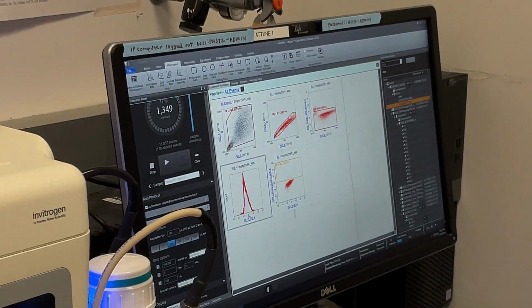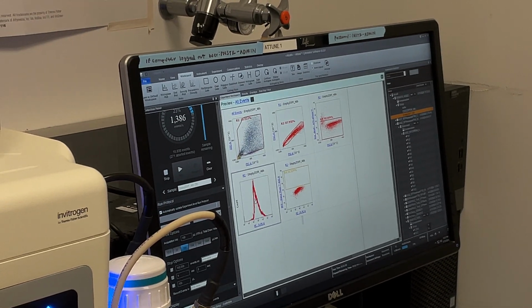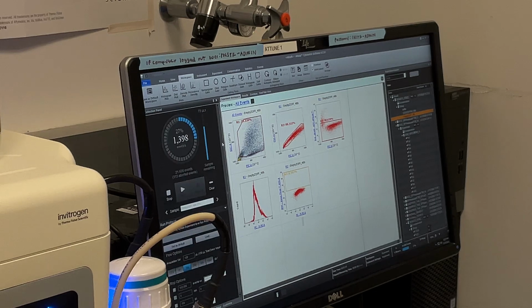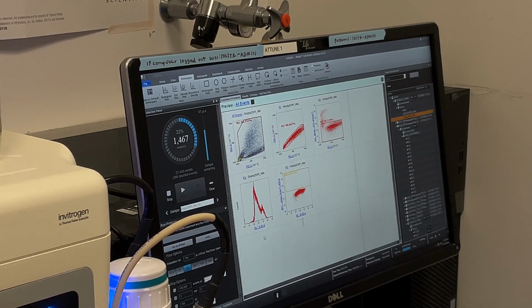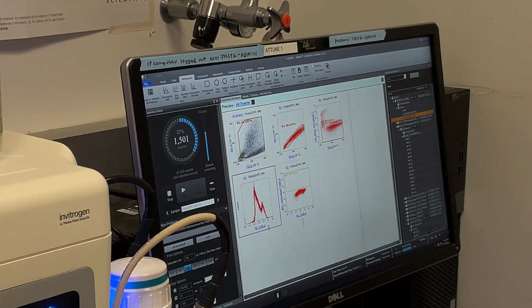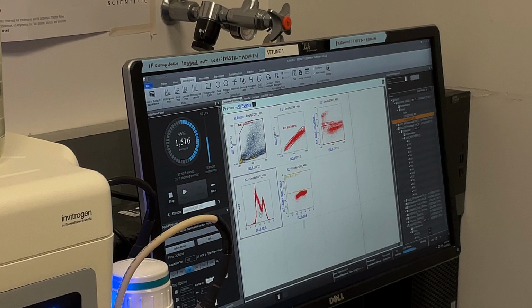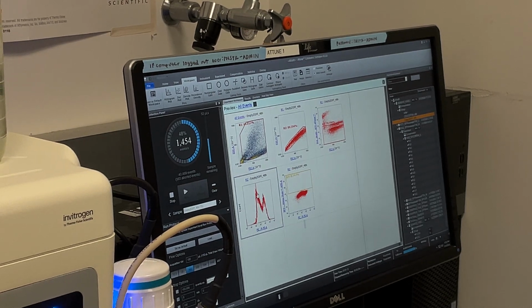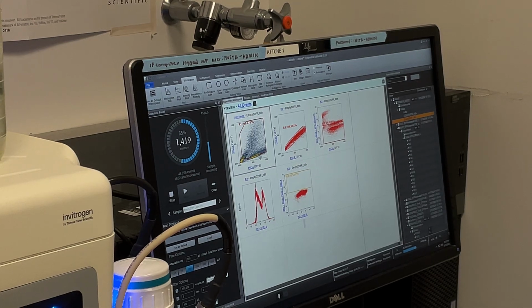So we have RPE low, the 3. Is the CD55 measurement? So this is the CD55 here. So that's our CD55. The top one was 0. And the second one is actually the signal for CD55.